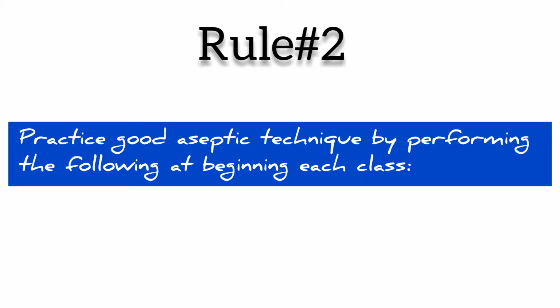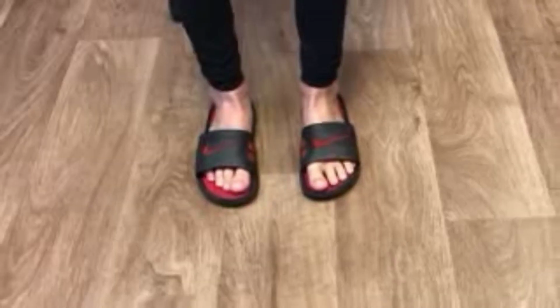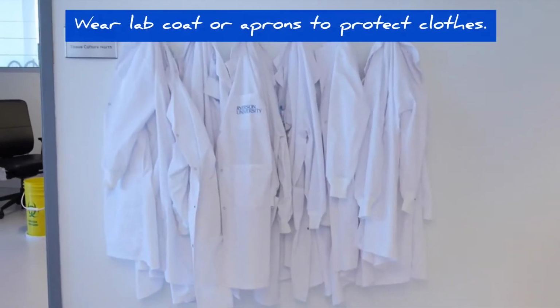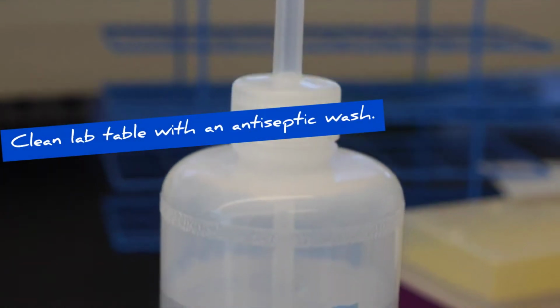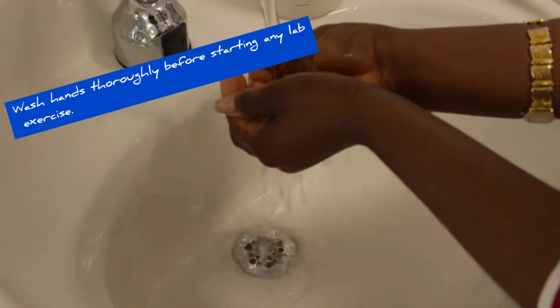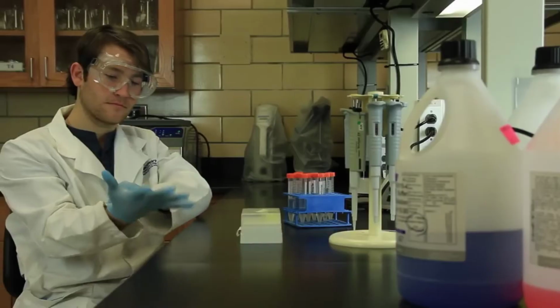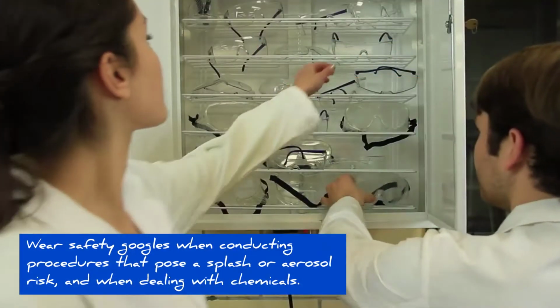Rule number 2. Practice good aseptic technique by performing the following at the beginning of each class. Tie back long hair. Wear closed footwear to protect the feet. Wear a lab coat or apron to protect clothes. Clean the lab table with an antiseptic wash. Wash hands thoroughly before starting any lab exercise. Wear disposable gloves when handling pathogenic organisms.